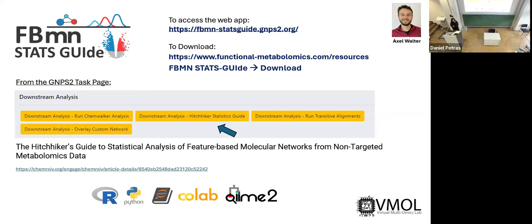And to say a few things about this project, we actually started this two years ago. That was my first workshop. I see some faces from the workshop. They would have also seen that we started with Jupyter notebooks, and they were playing around with it. But then we also built a community from these workshops, which is our virtual multi-omics lab. Many of the participants also became part of the lab, and they contributed hugely to the project as testers, and some were also helping with the code. So yeah, a huge shout out to them.